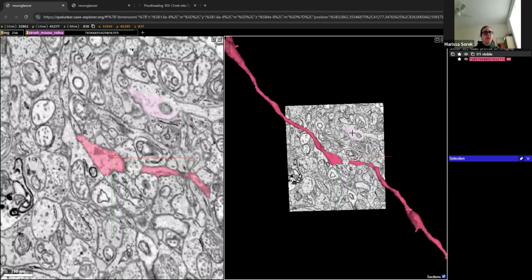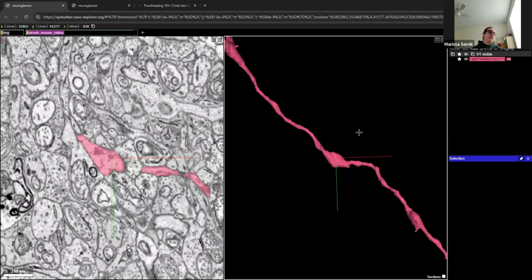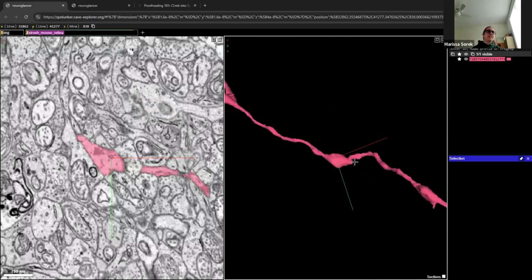For this demo though, I am going to hide that, and that's with S for slides or sections. That's also this radio checkbox down here to show hide that. It's a little easier to see as I show the navigation tools to hide this.